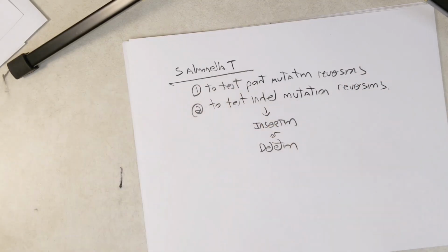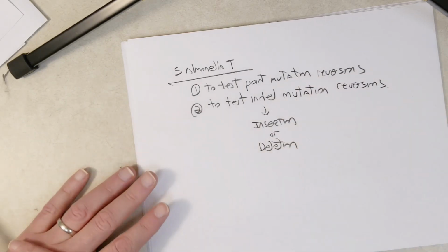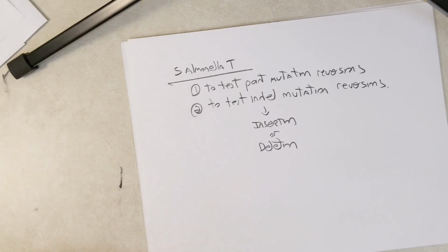So we can have 2 different types of strains to test the ability of chemicals to cause point mutations or to cause insertion and deletion type mutations.